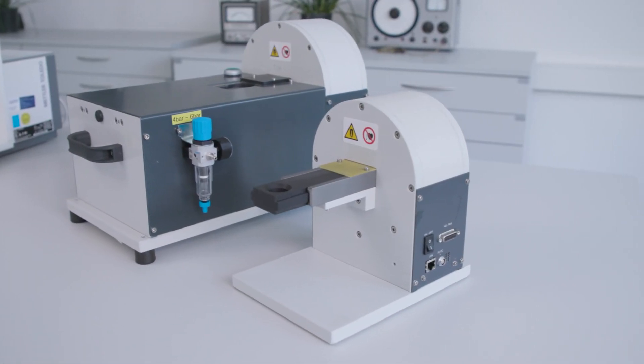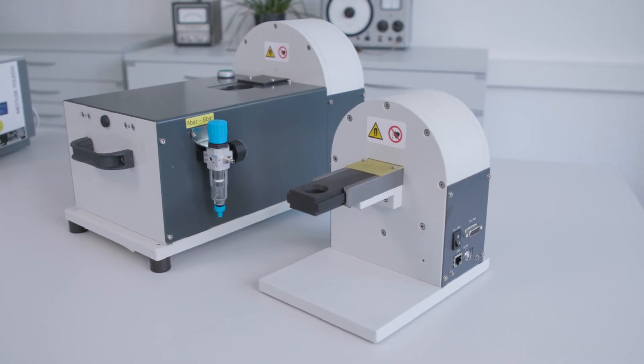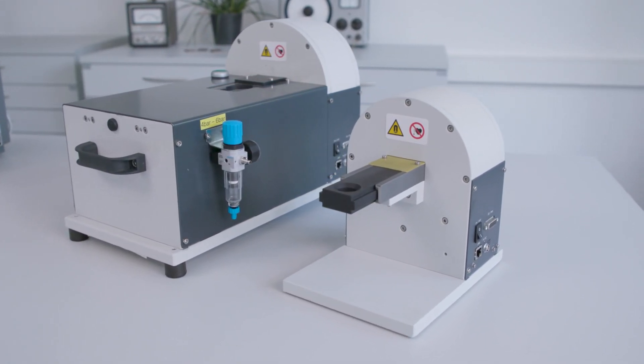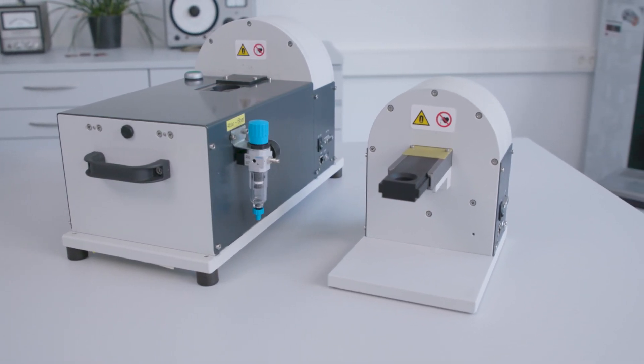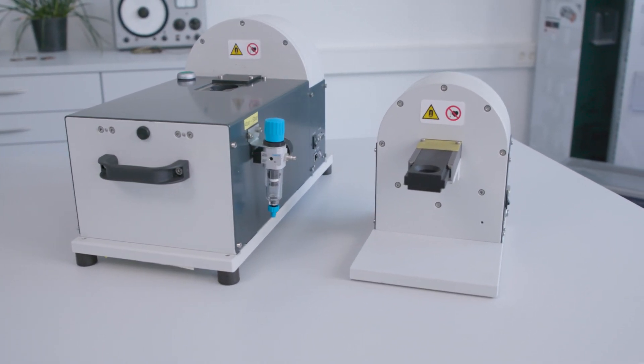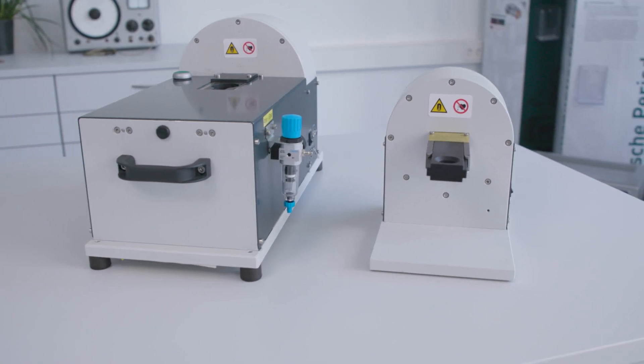For measurement of magnetic properties in the industrial environment, Forster developed the Corzomat product line. The Corzomat MIS system is a simple, fast, and precise solution to measure magnetization saturation on ferromagnetic materials and components.